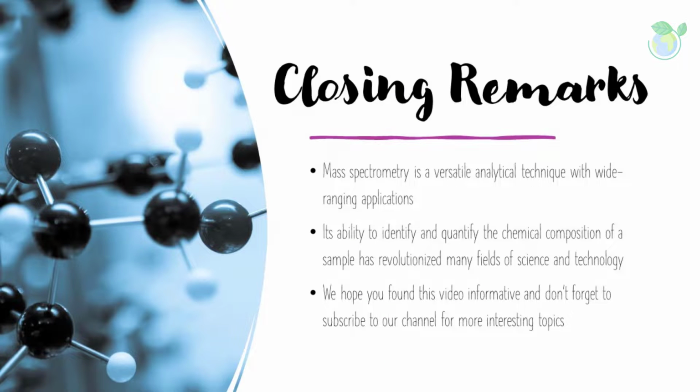Conclusion: mass spectrometry is a versatile analytical technique with wide-ranging applications. Its ability to identify and quantify the chemical composition of a sample has revolutionized many fields of science and technology.